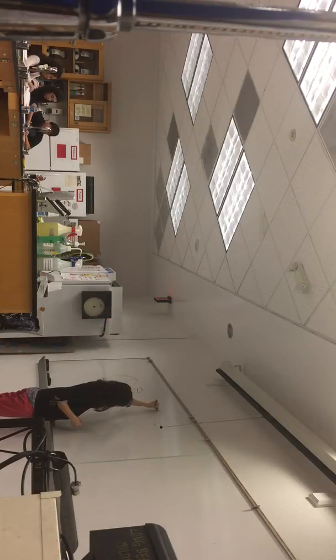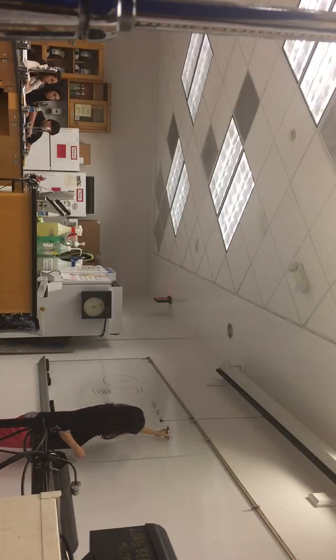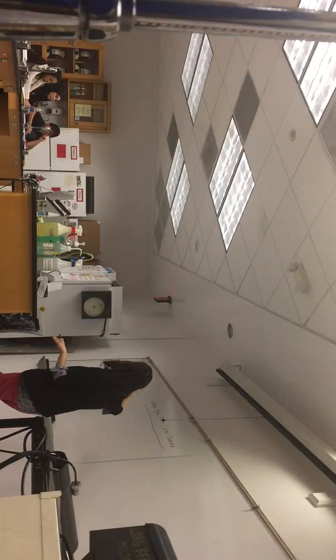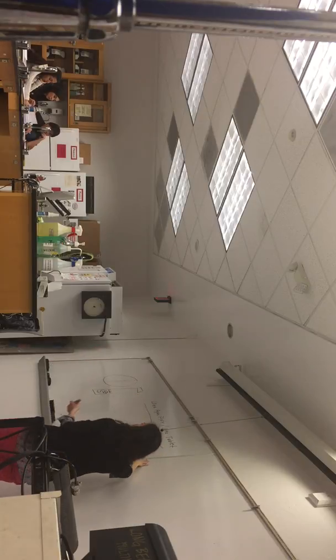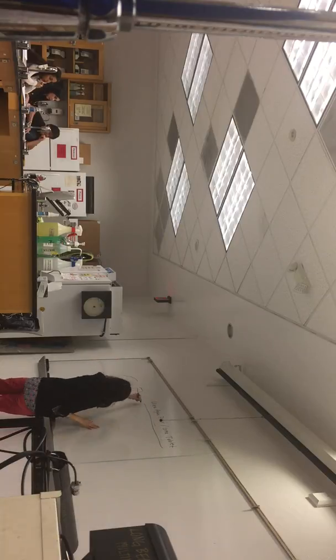You either did a urea agar plate, or you did the urea tablet. The other reason why we had you guys do both is we want you to be comfortable with looking at both for the project, because a lot of times we'll have plates, but then we'll run out, and then he'll start putting the tablets out. Either way, though, the ingredients are the same.